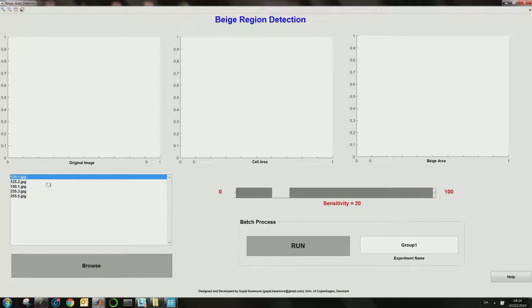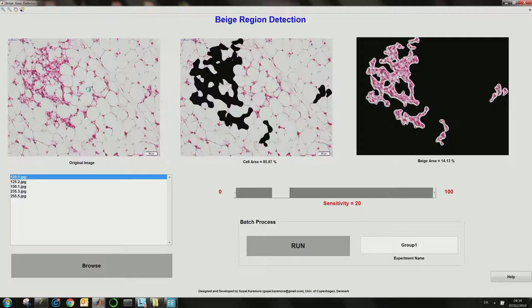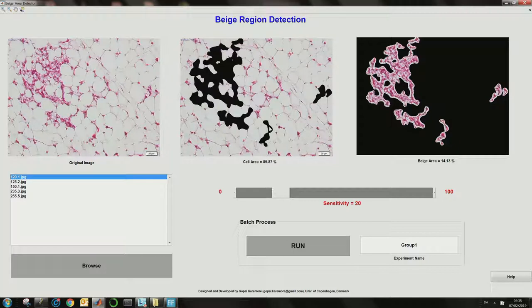The user has to double-click one of the images. As you can see, the output will be divided into sub-windows. The first window will display the original image, the second window will display the white adipose cell area percentage, and the third one will show you the beige area percentage.